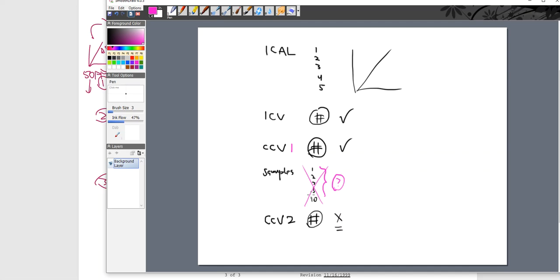It needs to check out in the beginning of that section and at the end of that section. And if it does not do that, then we're going to have to go back to the drawing board, and we're going to have to remake maybe CCVs or recheck the CCV to make sure it's still making sense, because something happened along the way that was a problem, and that continuing check was able to pick out that problem and that it happened. And it's telling me that on the report. So nothing can be reported here at all.